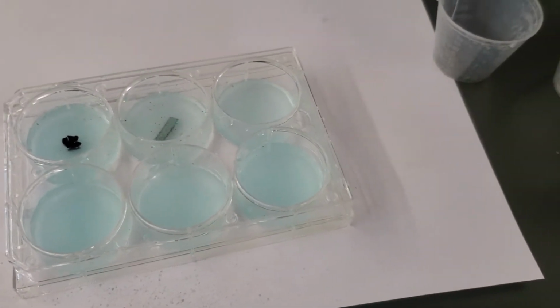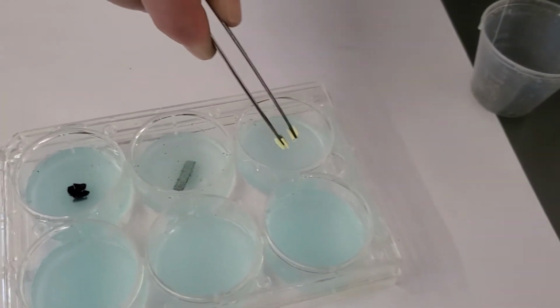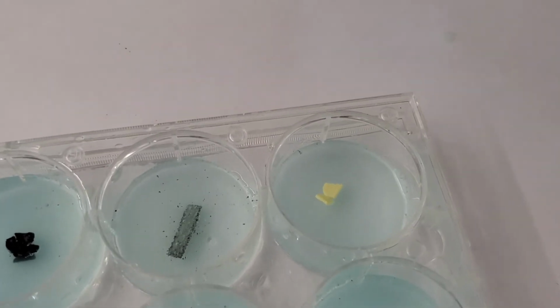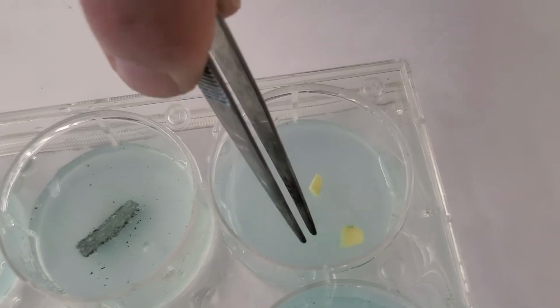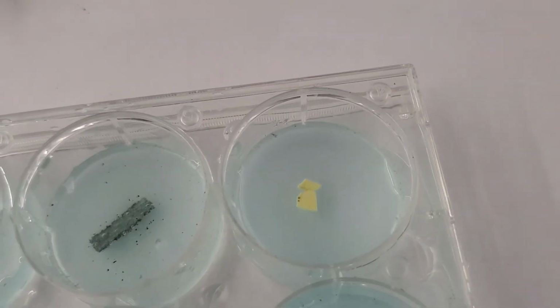Next we're going to do sulfur. That one doesn't want to sink. It wants to float on top.